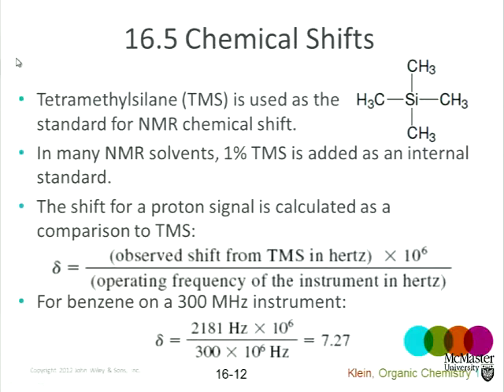The 3 protons in one methyl group are equivalent to each other, and the 4 methyl groups are all equivalent to each other. So tetramethylsilane has hydrogen atoms that are only in one environment, in the same way that it has only one type of carbon atom, and so this turns out to be a handy standard for proton NMR.